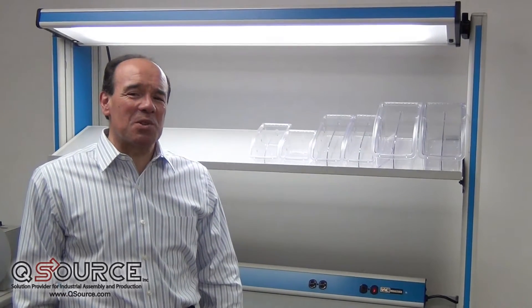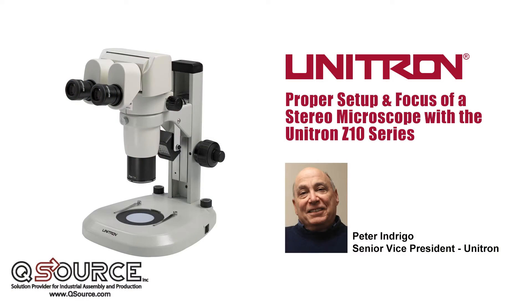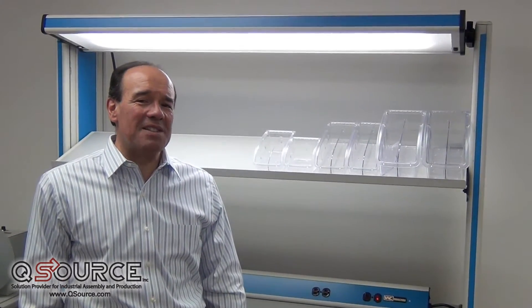Hi, and welcome to another installment of On The Bench. Peter Andrigo of Unitron is here to show us the proper way to focus a stereo microscope using the Unitron Z10 series.